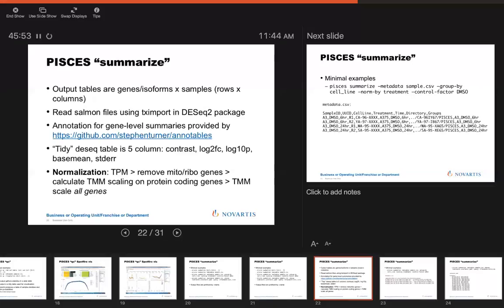I think that it's actually probably real. The reason that I say that is, the sequencing library that you submit and then sequence, the data that you get back, they're not normalized in any way. So whatever goes into the sequencing library is what you get out. And for certain ribosomal RNA, you know where that comes from, and you know that you've tried to remove that, hopefully, in your library preparation.